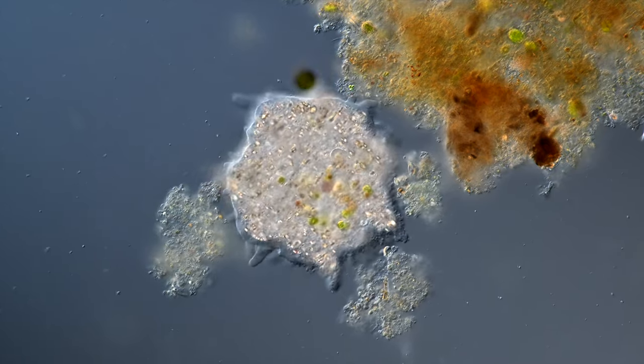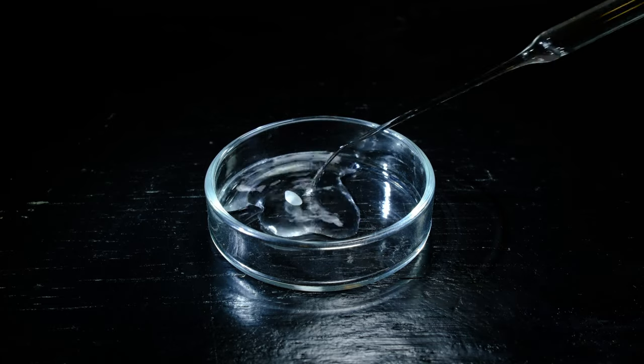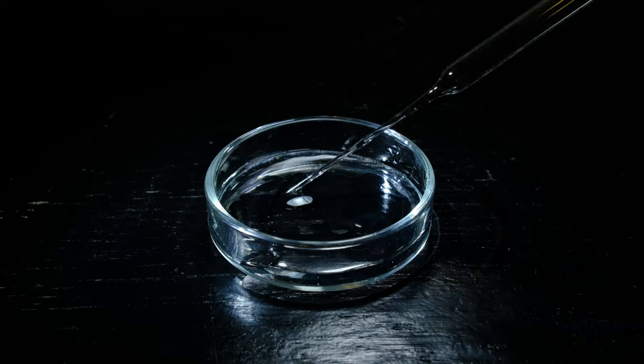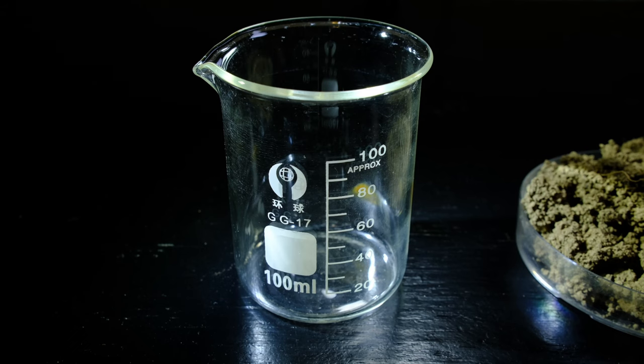If you should have amoebas in your sample, we can start to make the culture medium. First of all, let's soak the rice kernel with a few drops of distilled water and set it aside for 3 days. While we wait for the rice to soak, we can make the soil extract, which will be the core piece of our nutrient solution.